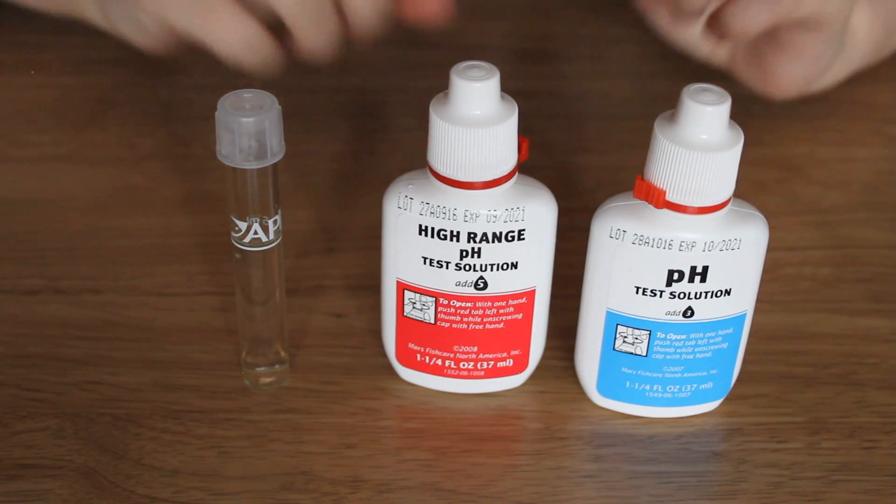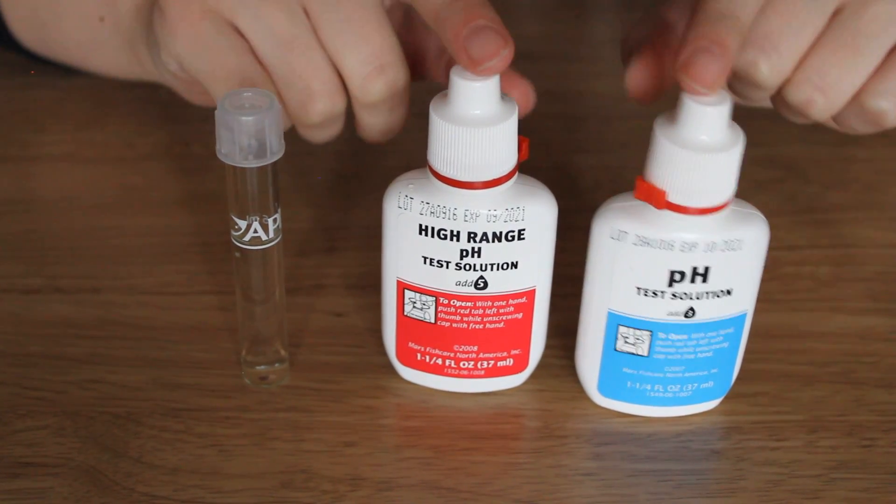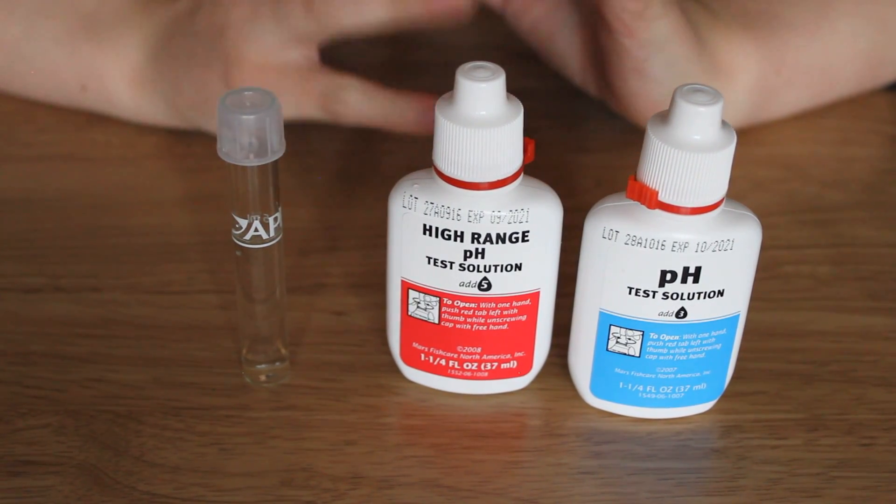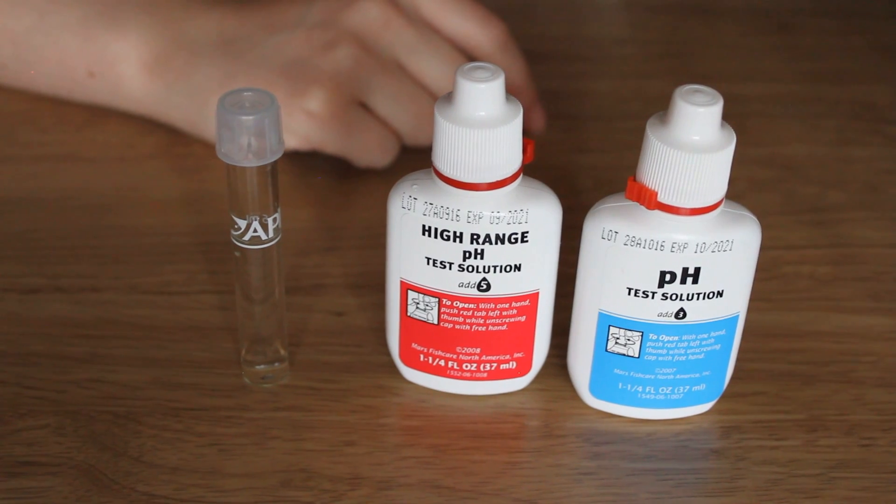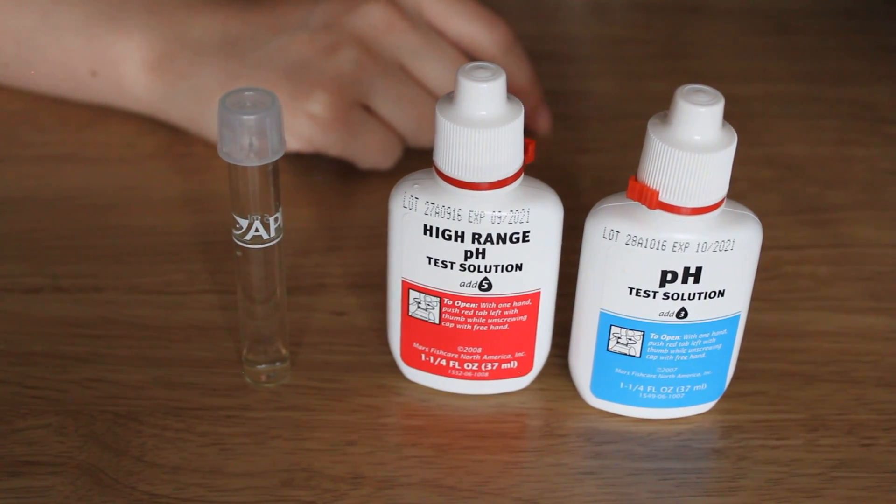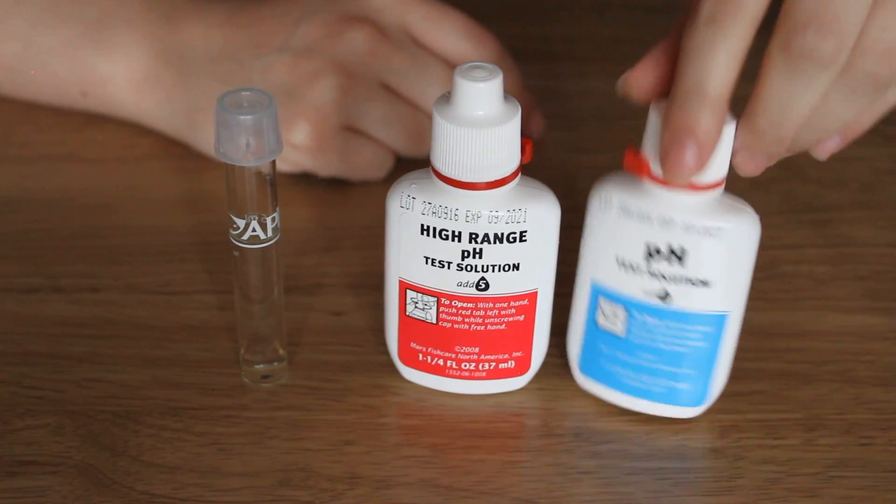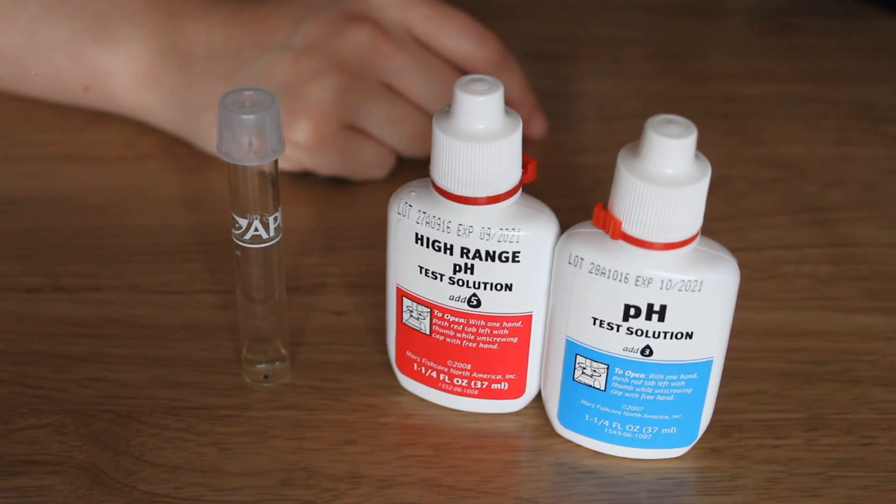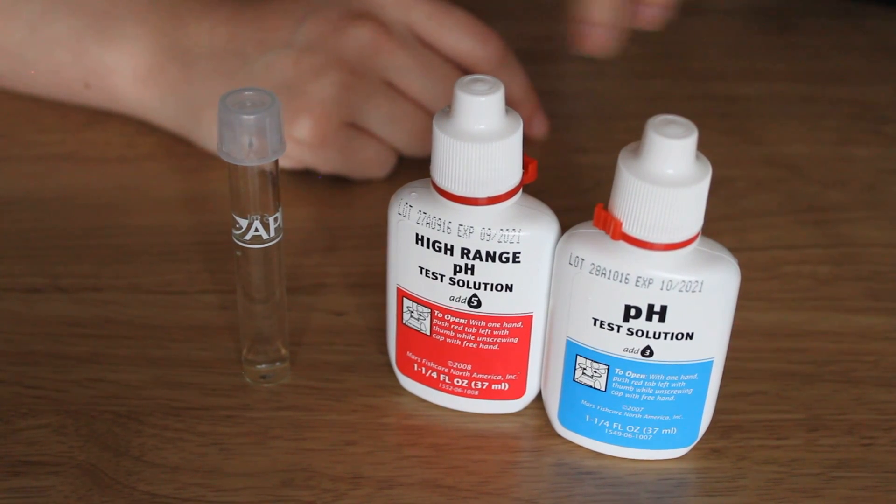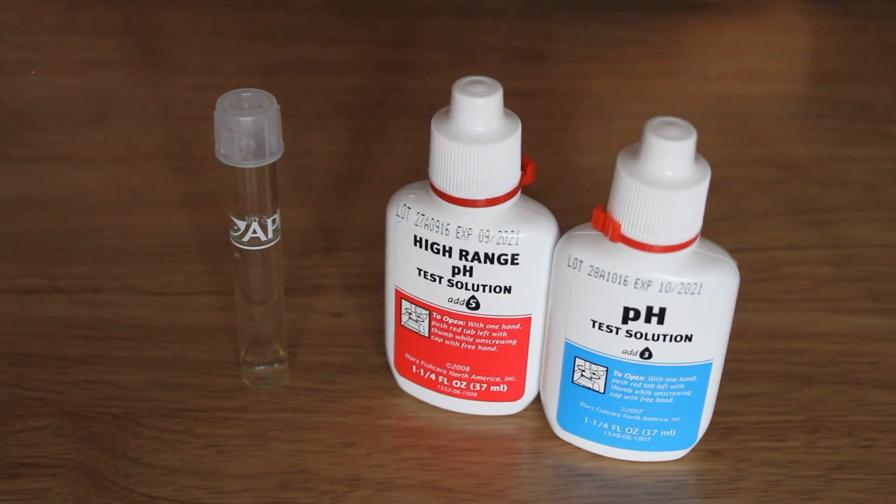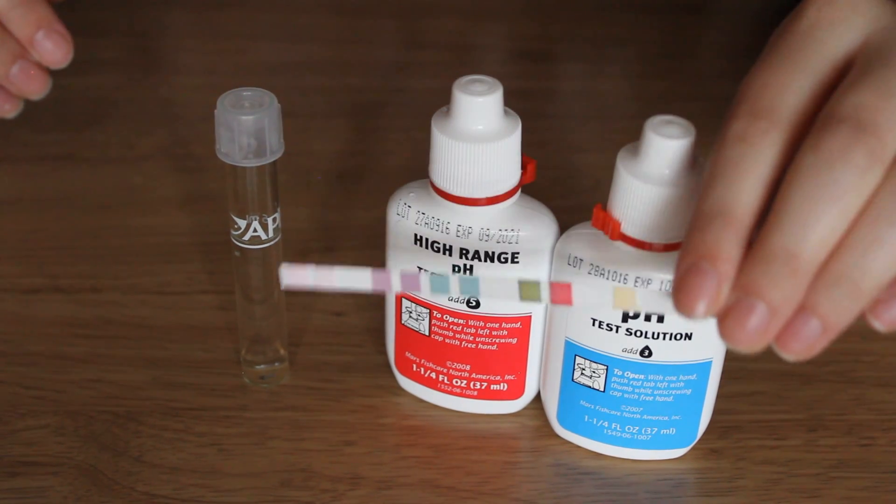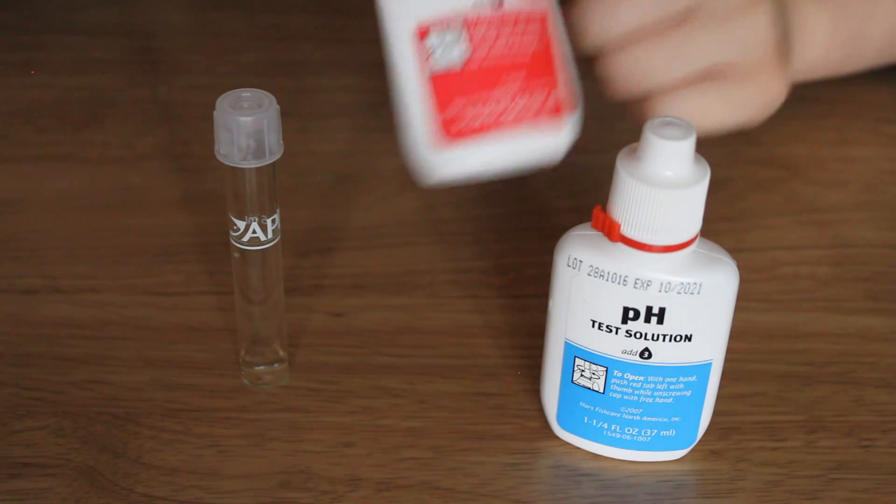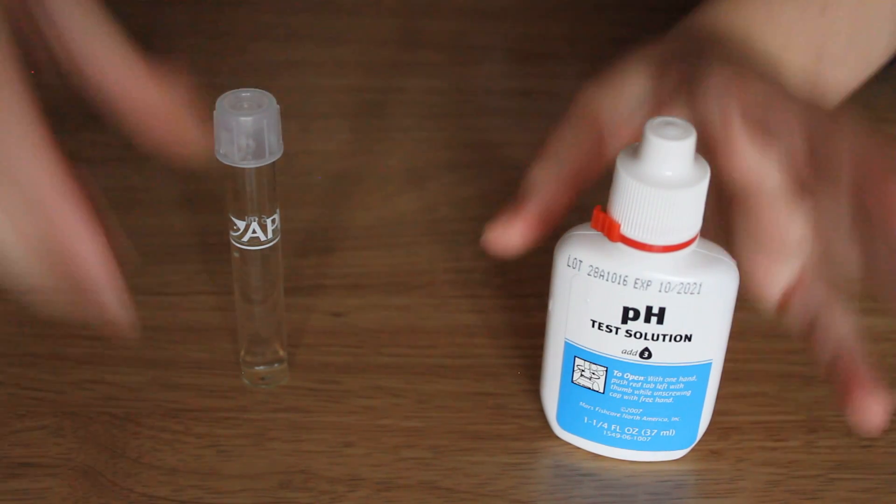Whilst we're still waiting for the other test to settle we're going to test the pH level. You'll find you have two different bottles for this. The blue one is for lower pH levels, but if you have hard water, if the water you're using for your aquariums tap water and you know it's hard, you'll want to use this red one. I do know the tap water here is hard but we're going to try them both anyway. As I said in the previous test, this tester strip is now moved to around 8.